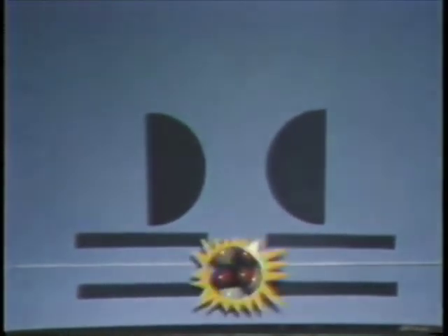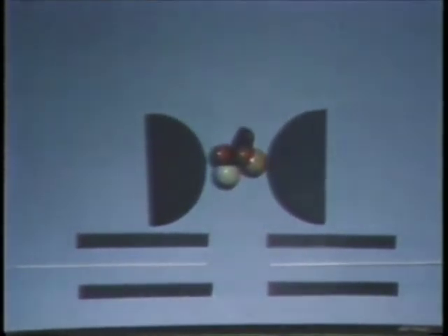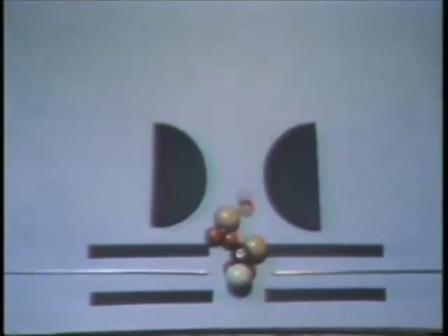In a mass spectrometer, molecules of a compound pass through an electrical discharge, which breaks the molecules into smaller charged fragments called ions. These ions then pass through a magnetic field, which, like the paperclip analogy, has the effect of deflecting the ions. Lighter fragments are deflected more than heavier ones.